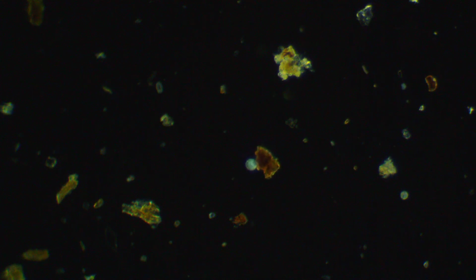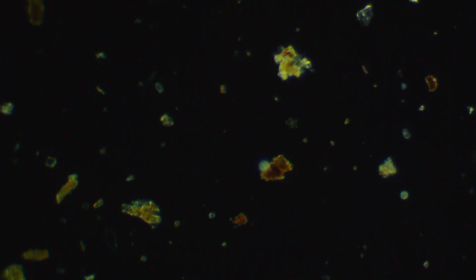I got these test tubes that come with screw top lids. I don't know how they're like metal lids. I don't know how watertight they are, but you probably have better ones. I think I've seen better ones with plastic lids that would be better for shipping.